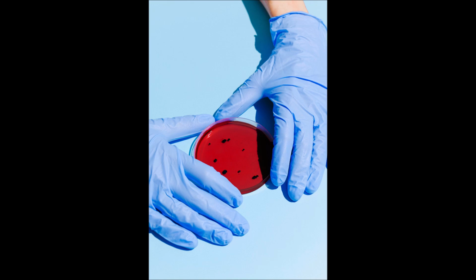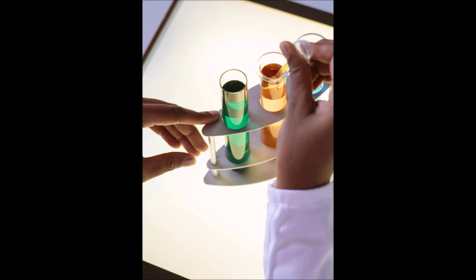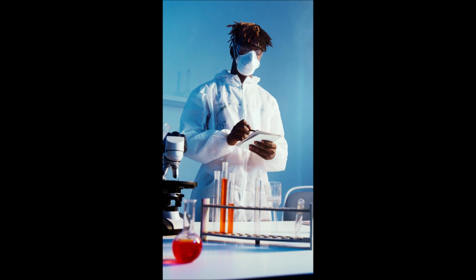The fourth step is handling samples, how you handle your sample when you collect the soil. You have to place the collected soil in a sterile container immediately, and avoid touching the inside of the sample container to avoid contamination. And the fifth step is to label after the collection. You label by giving the sample ID, the date, the time of collection, and the location details.